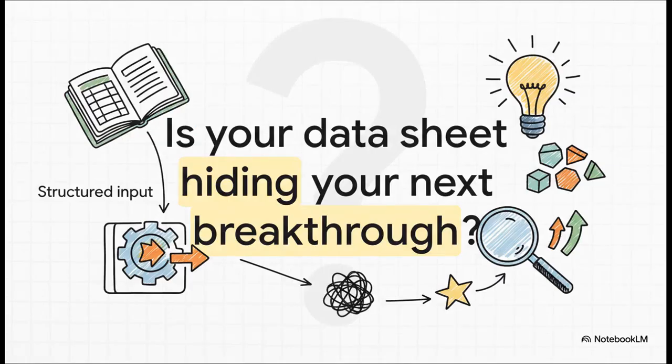And this brings us all the way back to that central idea. When you stop treating your data sheet like a diary and you start treating it like a structured input for a machine, you stop fighting with data and you start making discoveries. So take a hard look at your own process. Is your data sheet hiding your next breakthrough?